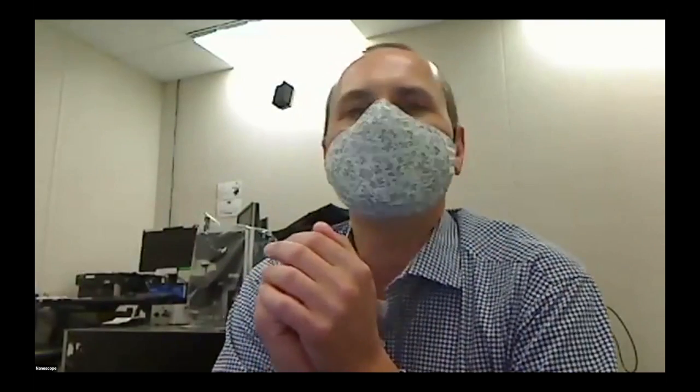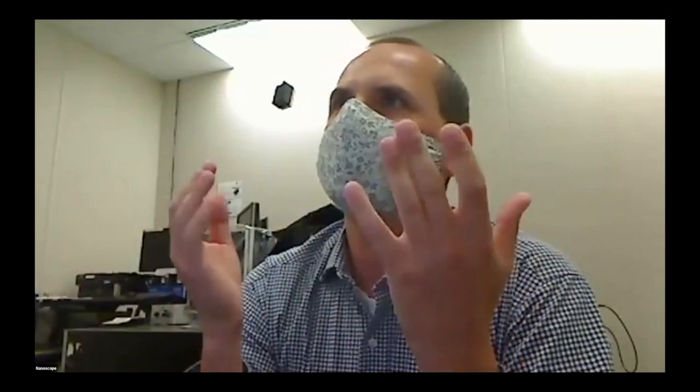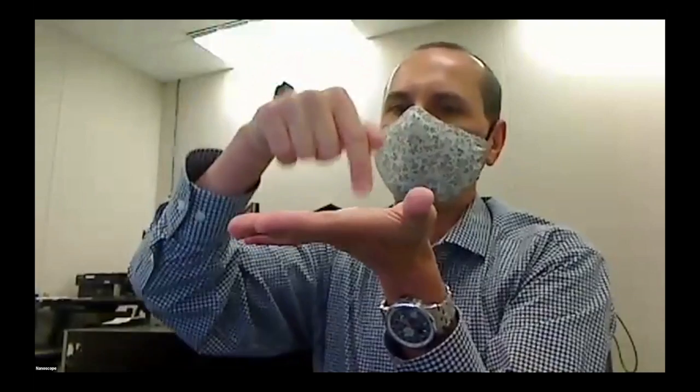Got it. So you guys probably learned something about AFM, I hope, so far. We did the magnet activity. Well, it's a scanning probe technique. So it is a microscope, but it's not a microscope that would focus anything or use any kind of light or electrons. Instead, it uses a probe, and that probe touches the surface or comes within a very close distance, so it can feel atomic interactions from the surface. That probe is very, very sharp. Let me show you what I mean.